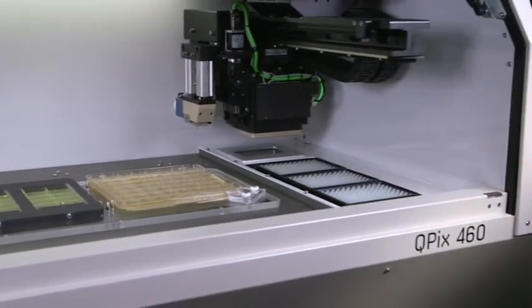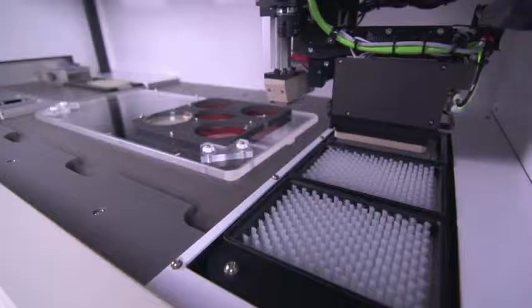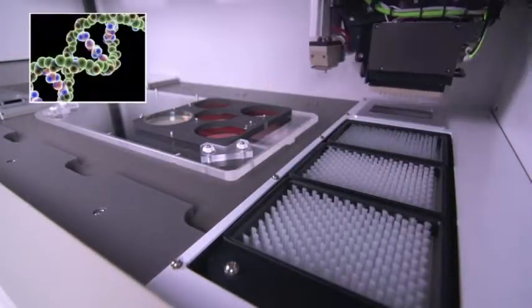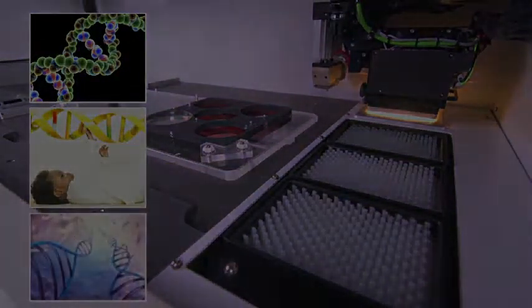Welcome. We're here to talk to you about the Molecular Devices QPIX 400 series of microbial colony picking systems. Whether you're working on biofuel, agriculture, phage display, or protein evolution, the QPIX can transform your research.